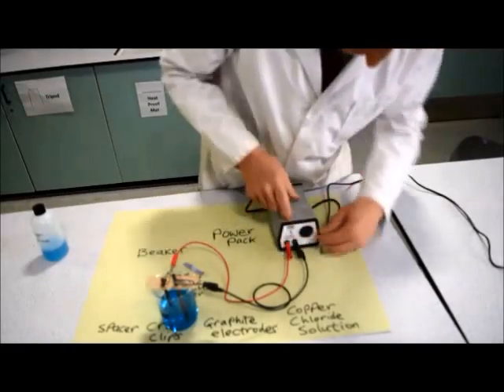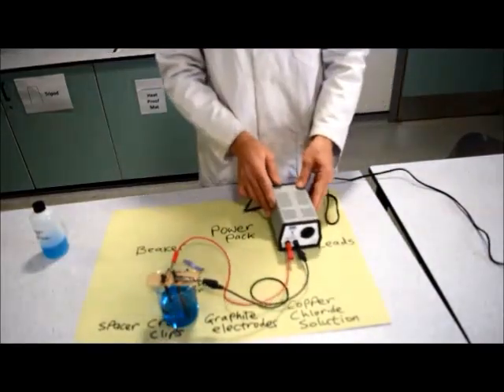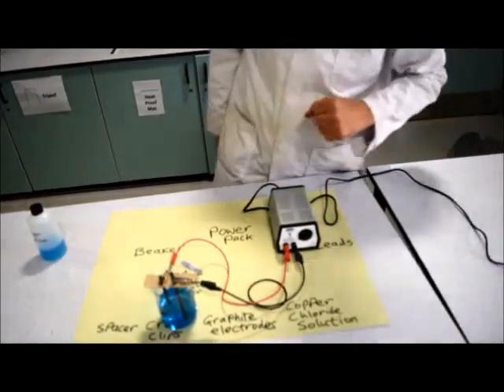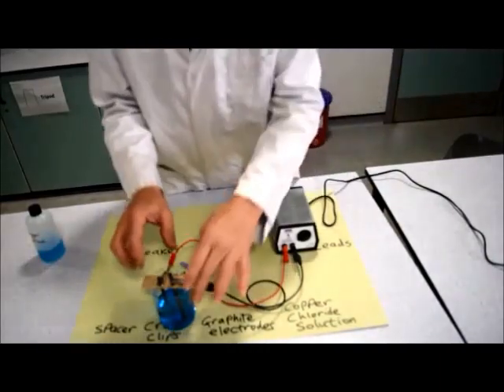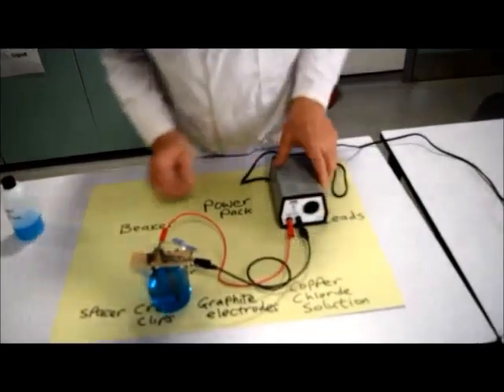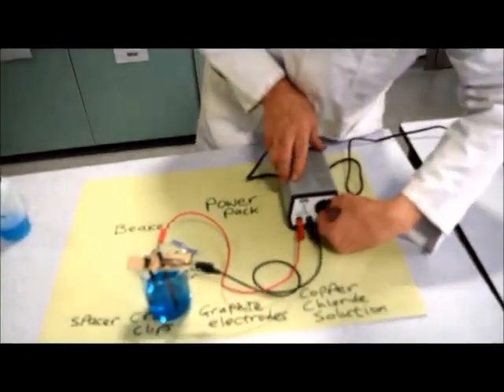We turn it to the lowest voltage on the power pack, then we switch it on and look at our electrodes. We're going to be looking for bubbles. If there's no bubbles, we turn the power up.